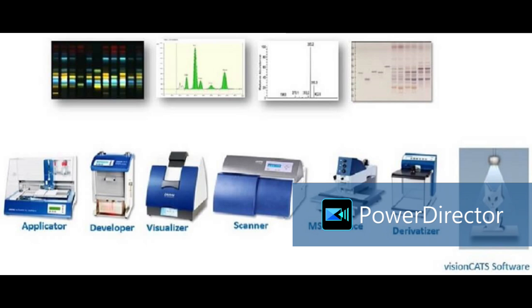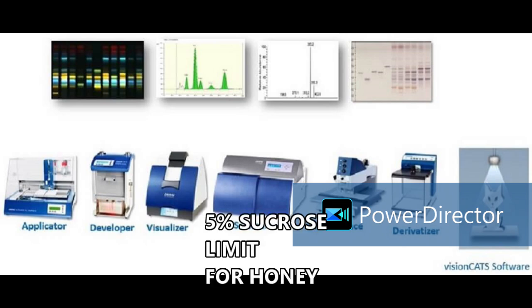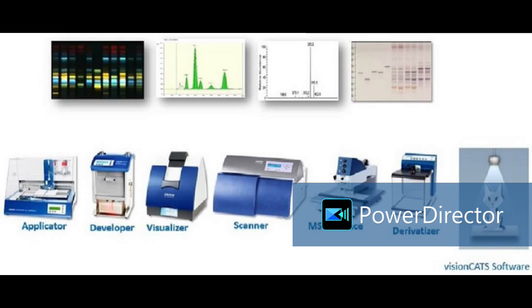Up to 5% sucrose is acceptable in honey. Means it is not that you add 5% table sugar, but if it is there, it is tolerated as per FSSAI. But if more than 5% sucrose is there, we can easily detect it through HPTLC. We can separate the sugar bands, and we can find out its amount.